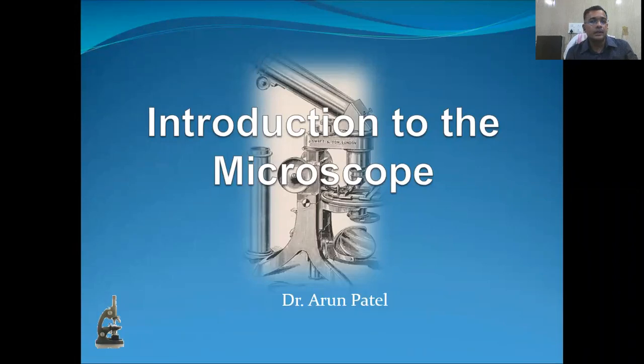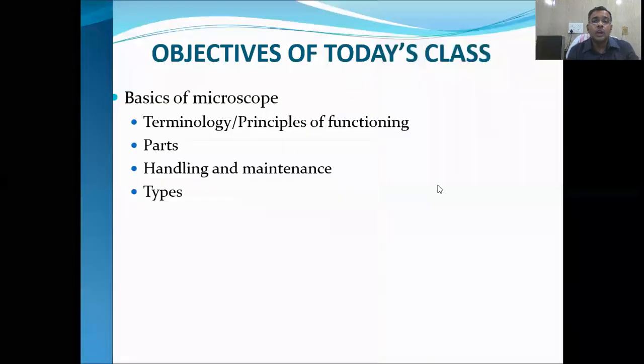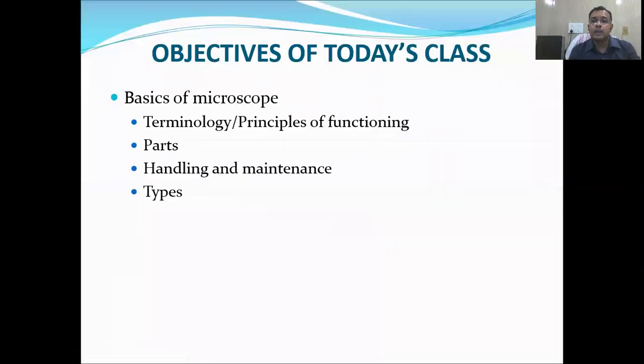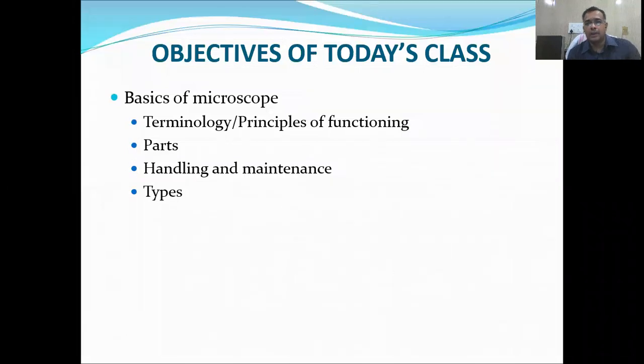In continuation with our microbiology class, today we will deal with the introduction to the microscope, or you can say the basics about the microscope. Before going to the actual class, you should know the objective of today's class. Today I will try to cover the basics of the microscope and particularly the important principle of microscope functioning, their parts and functions, how to handle and maintain the microscope in the laboratory, and at the last we'll deal with the different types of microscope available in the market for study.